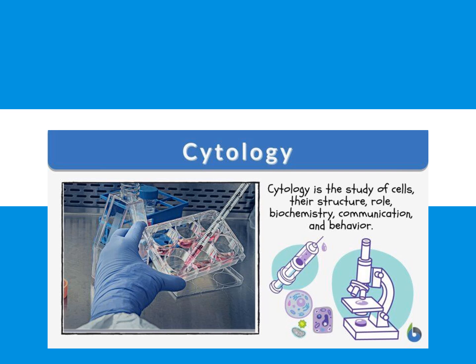Welcome to your last lecture on cytology. Cytology is the study of cells. And remember that the prefix cyte means cell, and their structure, role, biochemistry, and communication and behavior.